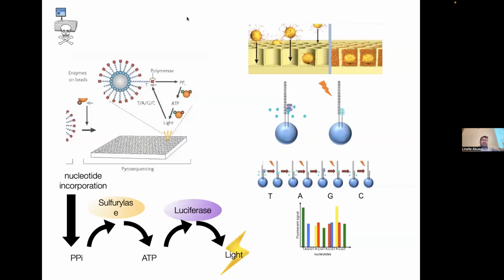And the way it works is you have this emulsion again. You have this bead covered with all this identical library, and you're going to put it into a well, 1 bead per well, right? And then you start the pyrosequencing reaction, which is essentially luciferase. So what you do, you take the plate, and the plate looks like this one.